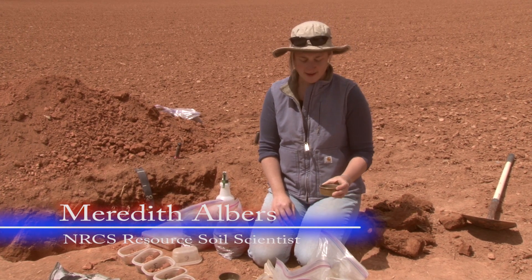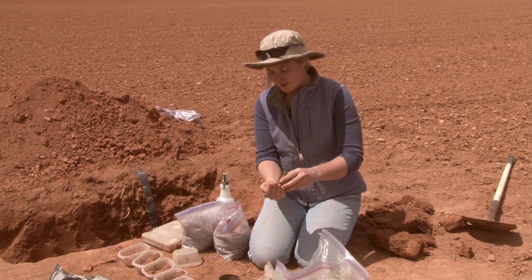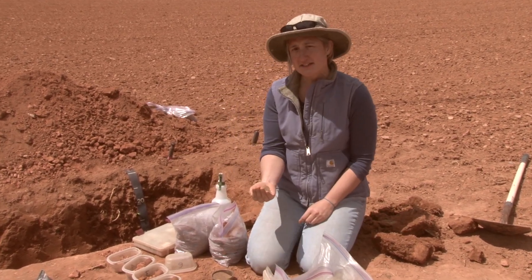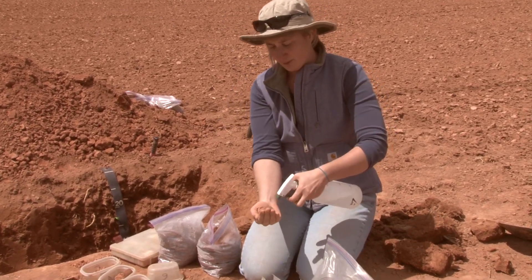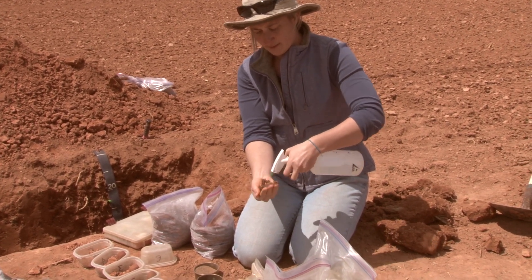For the envirothon test you're going to have to do texture samples. I've got a material here and we're going to find out what it is. The first thing you want to do is determine if you've got a very sandy, a very silty, or a very clay soil. We have a portion in the hand and we're going to get it wet and form it into a ball as best we can.